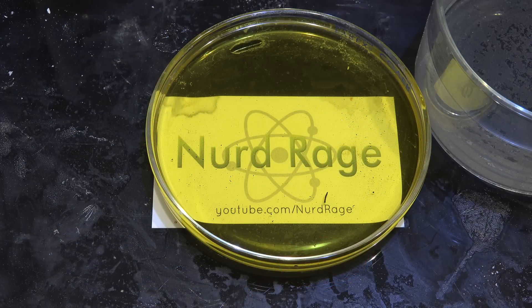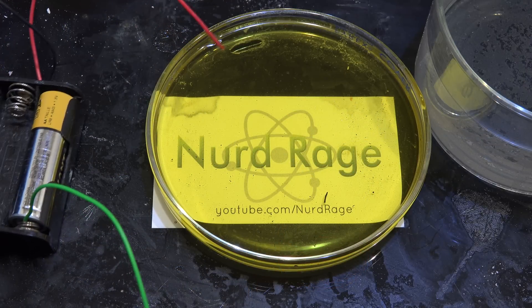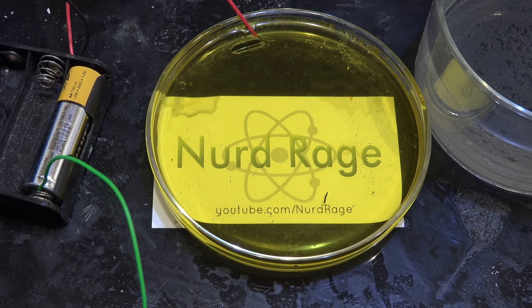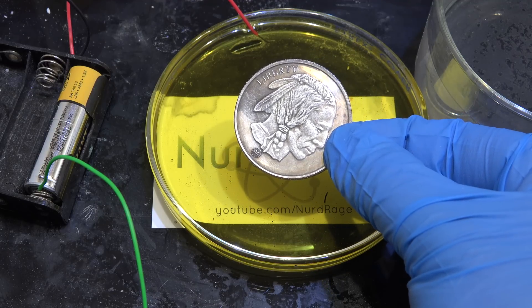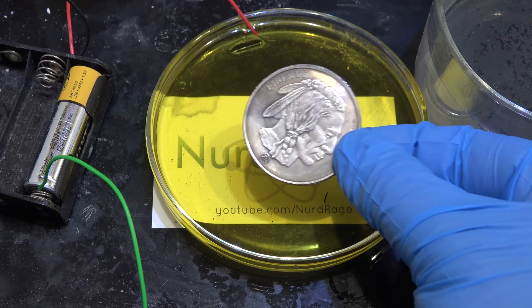Here I've poured out the anodizing solution into a shallow petri dish. Now we're going to need a battery to force the oxidation of the silver. I'm using just a single 1.5 V battery since it works slower and lets us better control what we're doing. And here is our silver coin — technically this is a silver round but the chemistry is the same.